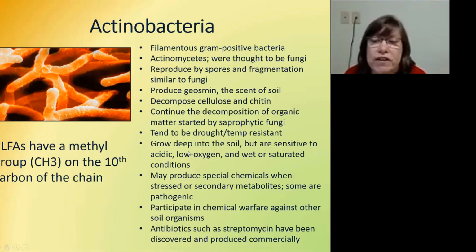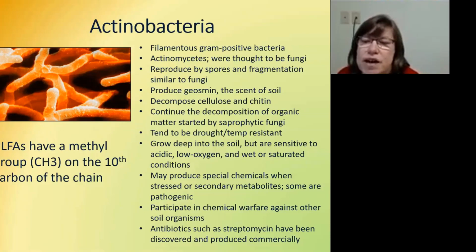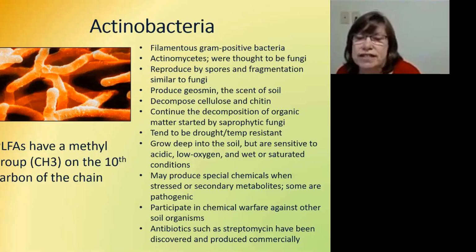They continue the decomposition of the organic matter that was started by the saprophytic fungi. They tend to be drought and temperature resistant. They, like the gram-positives, which they are a part of, grow deep into the soil, but they're sensitive to acid soils, low oxygen, and wet or saturated conditions.